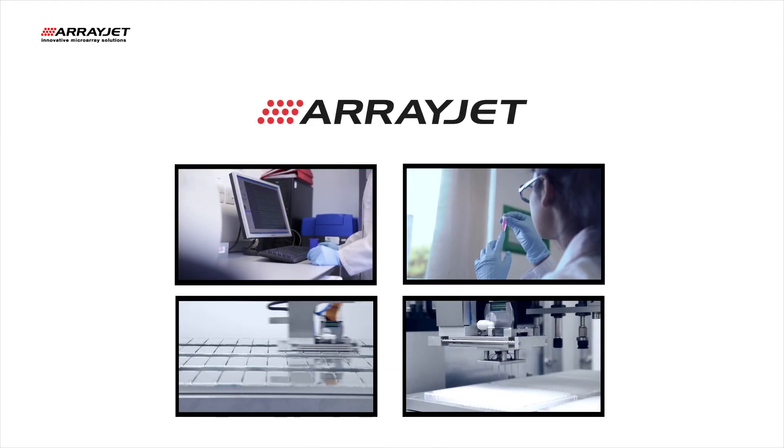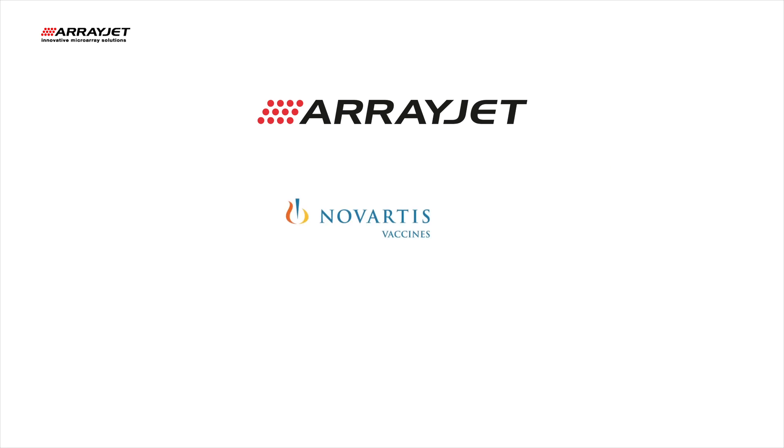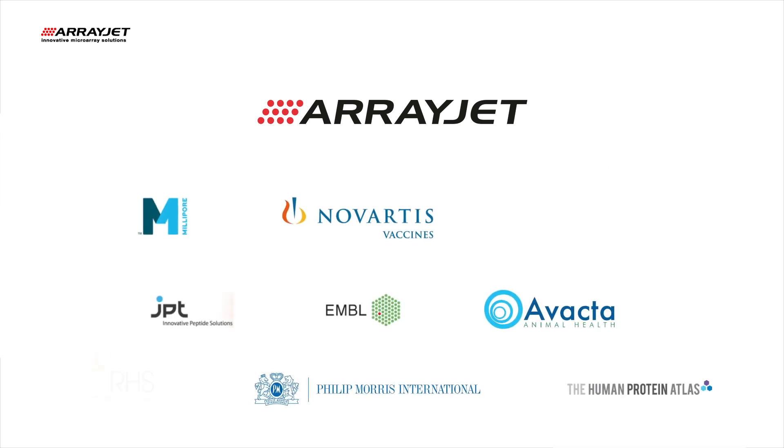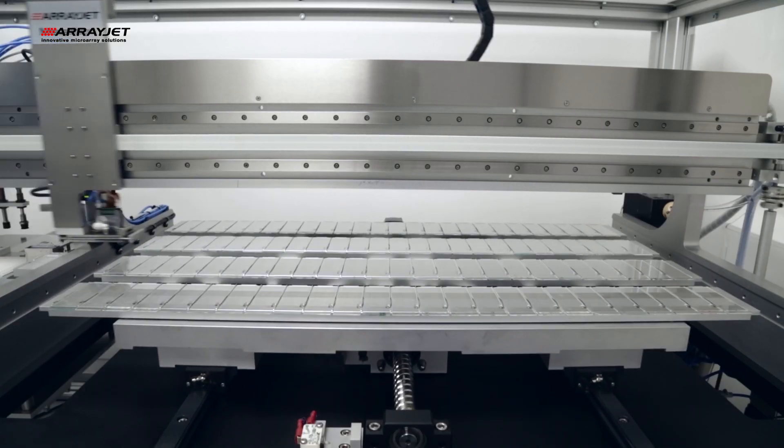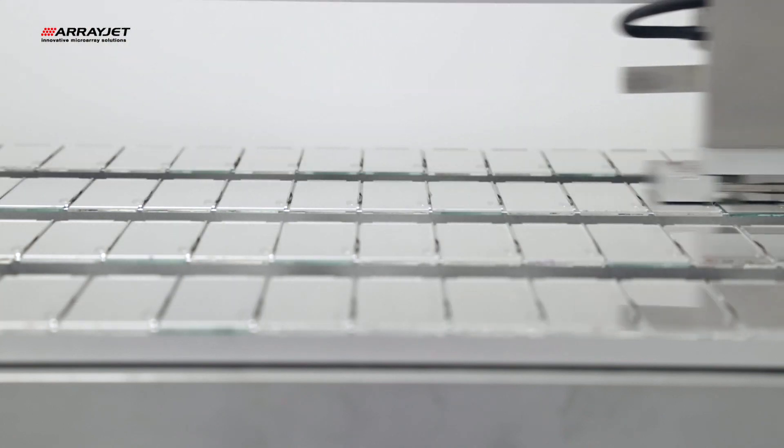ArrayJet provide innovative microarray solutions to researchers, drug development groups and diagnostic companies worldwide. ArrayJet technology offers true inkjet printing capabilities through non-contact, on-the-fly printing.